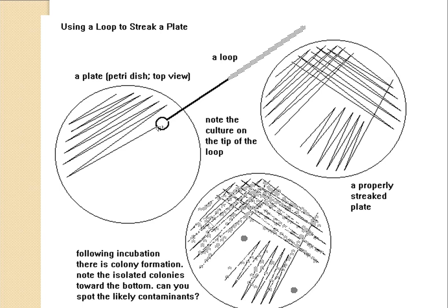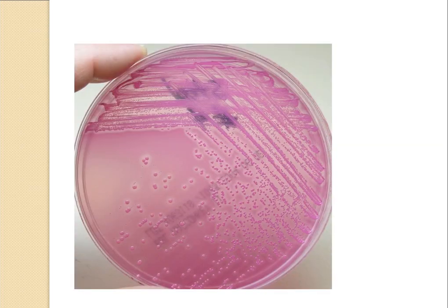The result obtained from the quadrant method: in the first quadrant the colonies are very crowded and cannot be isolated. In the second quadrant the number of colonies decreases, and in the third quadrant there are fewer colonies. In the last quadrant, only one or two colonies can be easily isolated. This is demonstrated on MacConkey's agar with a gram-negative bacterium.